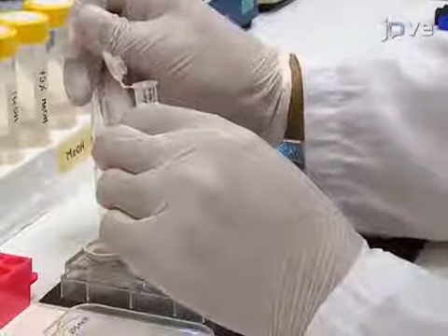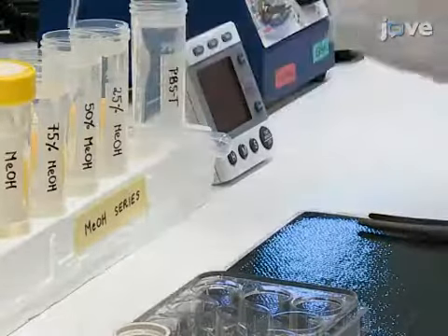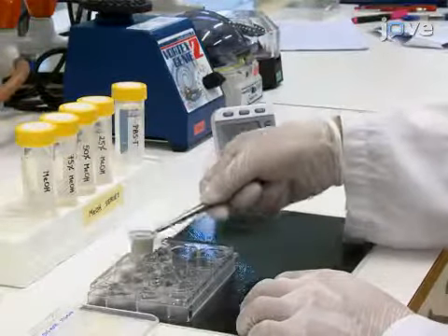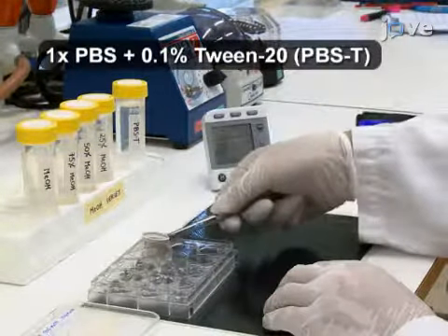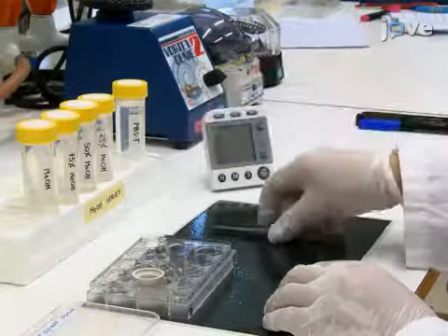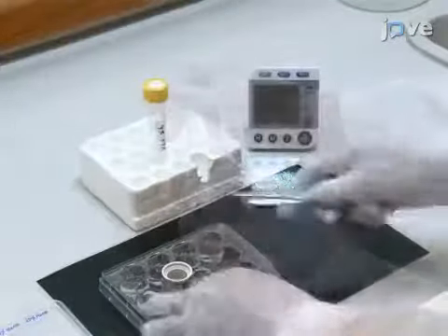Rehydrate the embryos using 3-minute incubations in a decreasing methanol series: start with 75% methanol in PBS, follow with 50% methanol in PBST, then use 25% methanol in PBST, and finish with two incubations in pure PBST. Next, prefix the embryos in 4% paraformaldehyde in PBS for 20 minutes at room temperature.